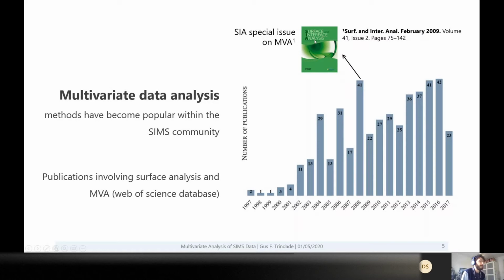There are several papers there. It's more than 10 years old now, but it's a really good reference because many of the standards for MVA of ToF-SIMS were set at that time. And I think soon we will have another special issue to update on all these things.